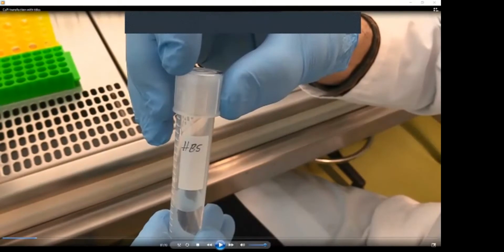This depends on the cell type naturally. So with some cell types, it's very good and the efficiency is sufficient. With these MEFs, with these particular MEFs, it's not so good. Notice this information because this is necessary for the explanation of our results.